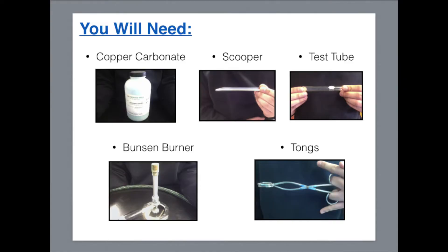For this experiment, you will need copper carbonate, a scooper, a test tube, a Bunsen burner, and tongs.